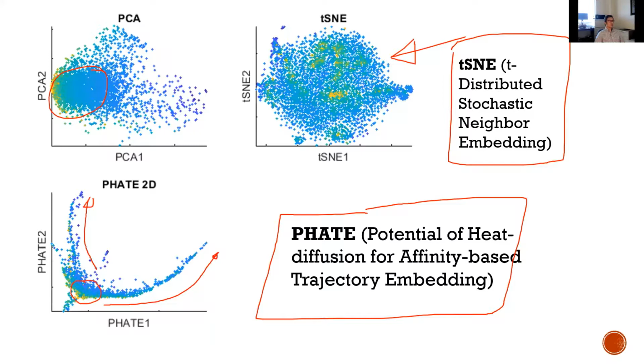They're very useful because later we will mention pseudotime trajectory analysis. So you can build the trajectory among your cells to illustrate cells which are at different development stages, for example, but you just cannot create those trajectories among cells represented using the tSNE coordinates.